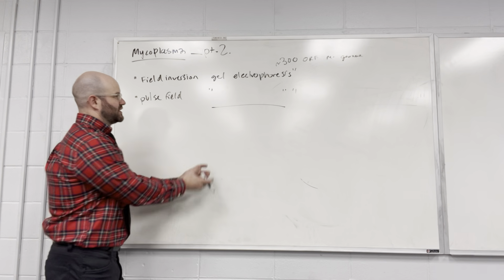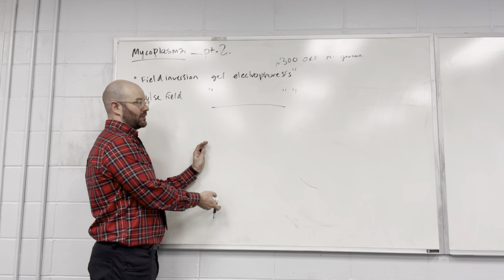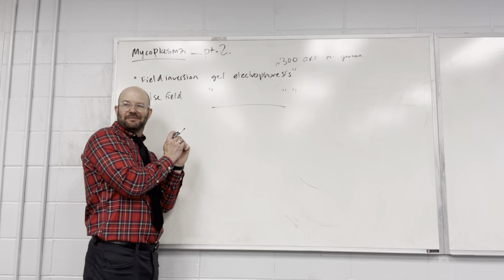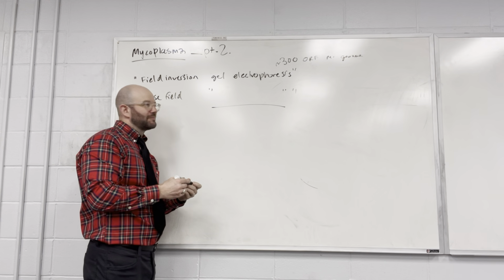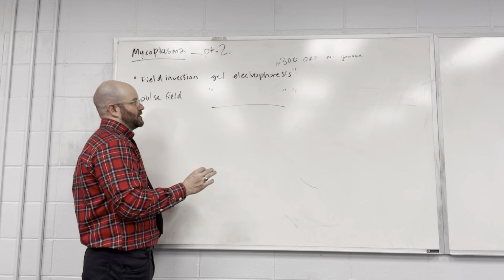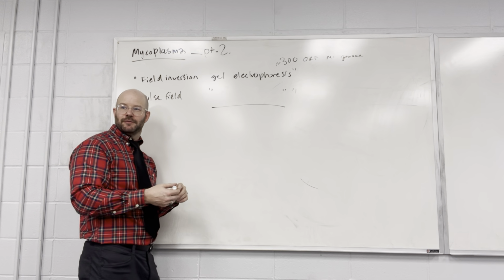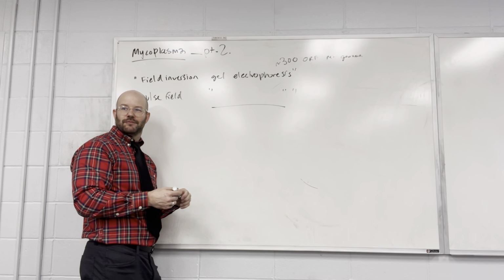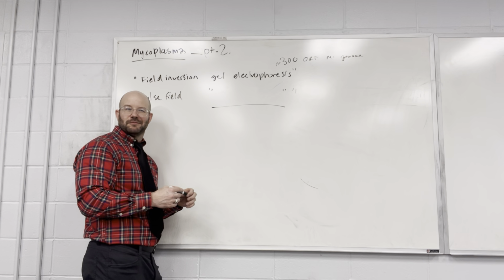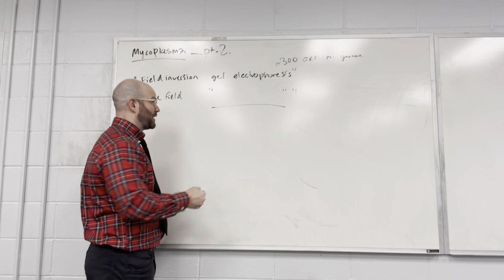What's the problem with standard agarose gels in this paper? Why couldn't they just run a normal agarose gel? Emma. What's the limitation of a normal agarose gel that makes it not work in this particular case? Chris? Size? Oh, yeah, okay, you got it.